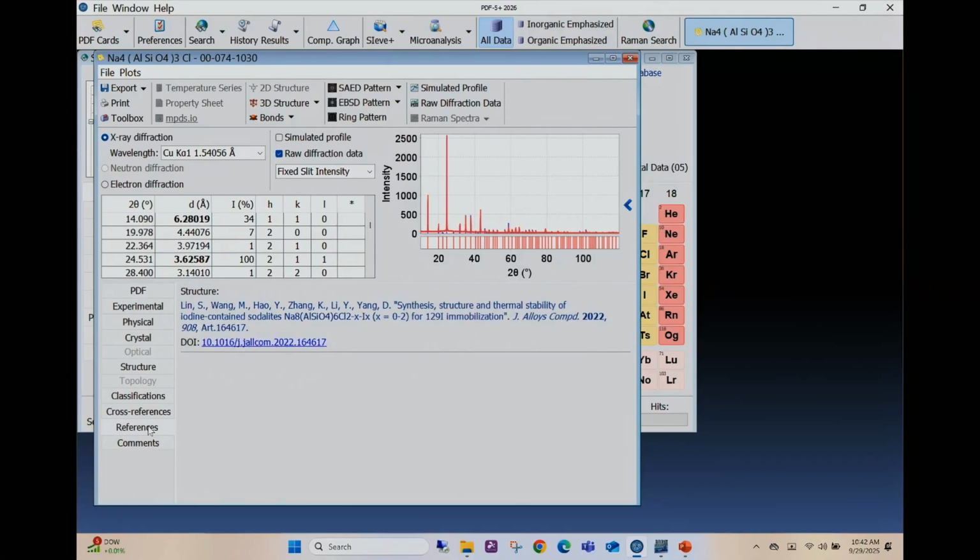You can click on references here, and this is kind of handy because sometimes somebody gets a match for something, and they say, I wonder how they made their sample. I wonder how they did their data. We're working, and it's kind of working now, newer issues and journals, it's easy to include the DOI. We're working backwards on the 85 years of data that's there to try to get more DOIs in here so that you could at least see what the literature abstract was, and then if your institution has a subscription, you can get that particular article.